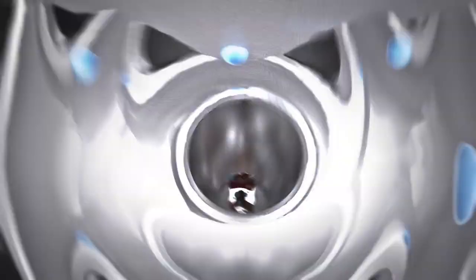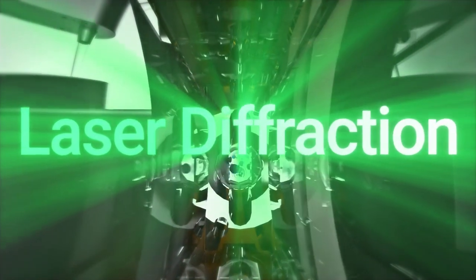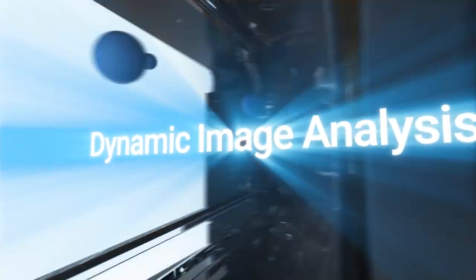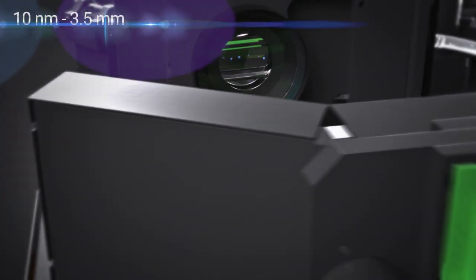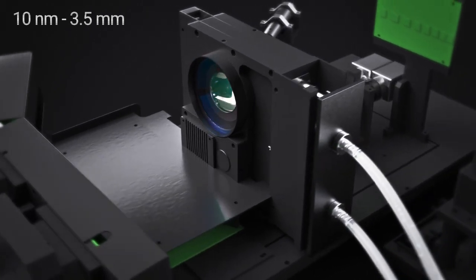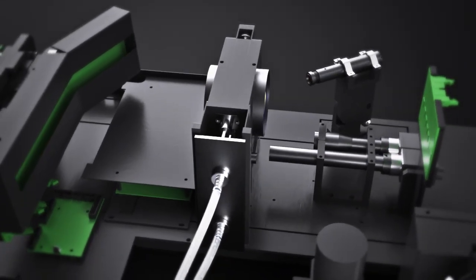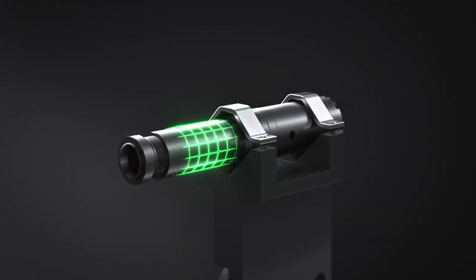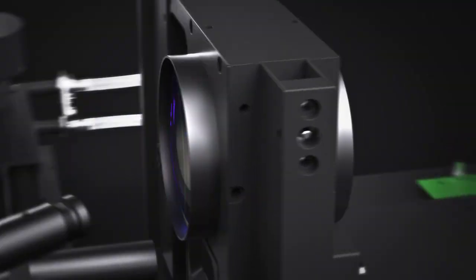The Betasizer S3 Plus combines laser diffraction and dynamic image analysis in one system to measure particle size and shape from 10 nanometers to 3.5 millimeters. The revolutionary Deloy Dual Lenses Oblique Incident System includes a monochromatic green laser source and two lenses.